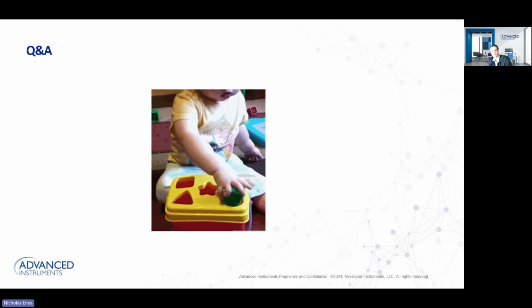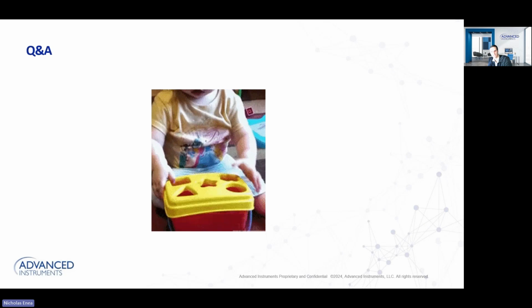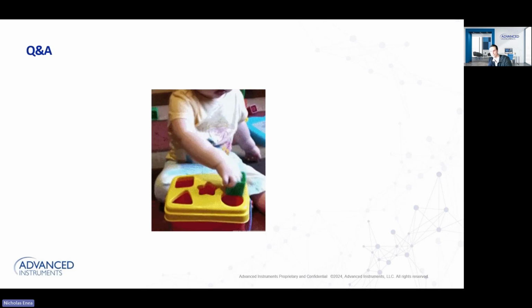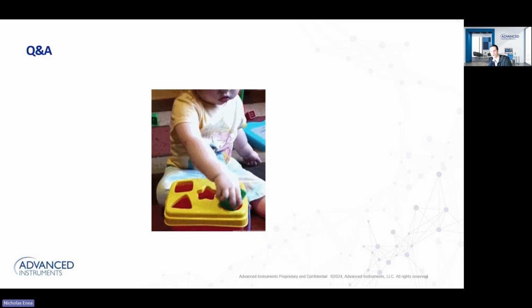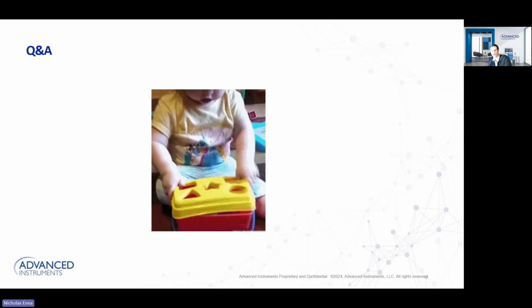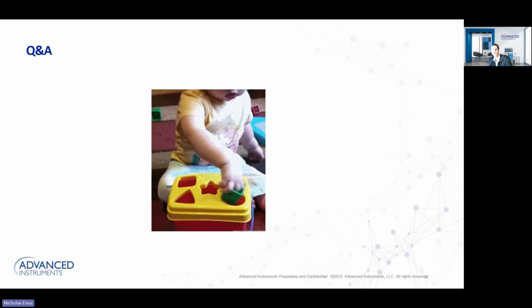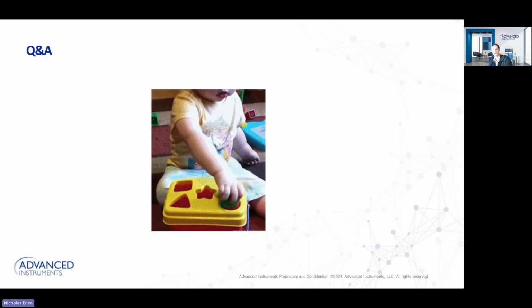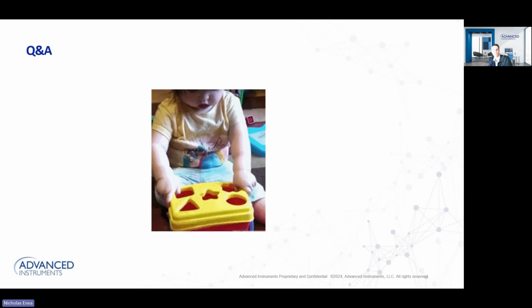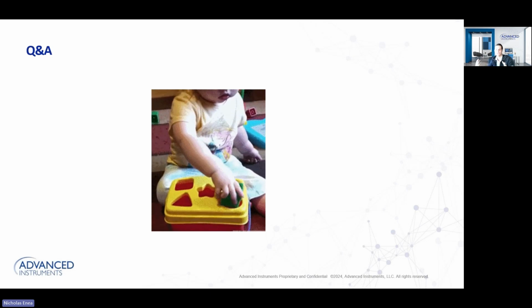Tolerances are just that, right? We want to be able to adjust our tolerances and put them in the right bucket, in the right hole in this case as well. We don't want to set tolerances that are not in accordance with our regulatory standards or a specific applicational focus, because then we're just going to be hitting our heads against the wall to understand why we're not hitting those tolerances, or failing products or failing liquid handlers, pipettes or liquid handlers that are actually passing. We just put too tight of tolerances.